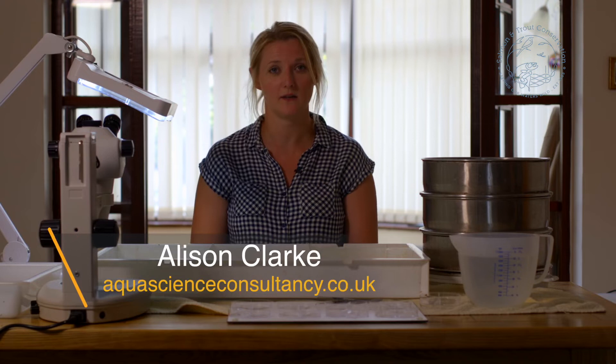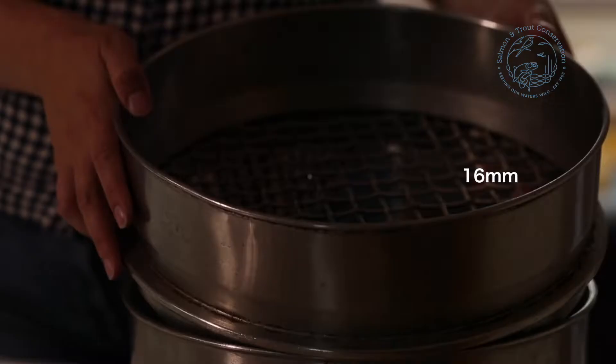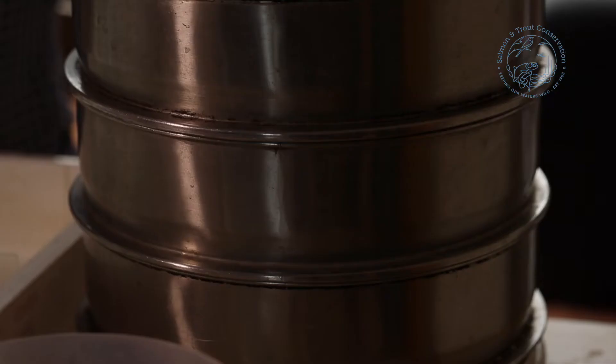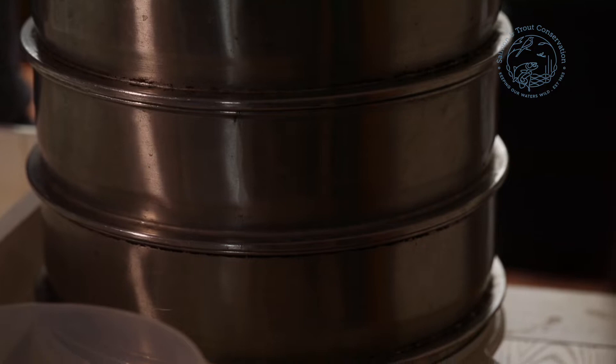First things first, we're going to take a look at the equipment that we're going to need to go through this process. The first thing is our sieves. We have a range of sieves in different sizes — this one being a 16mm, this a 4mm, and this has a 0.5mm grid in it.